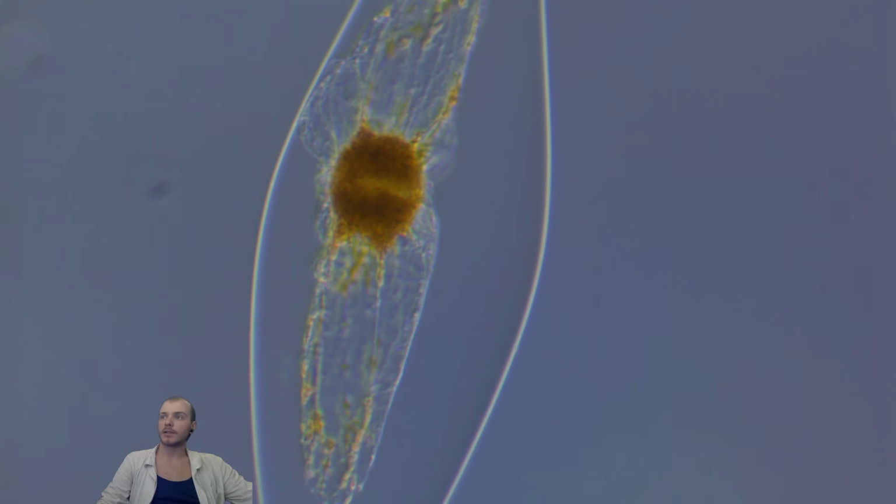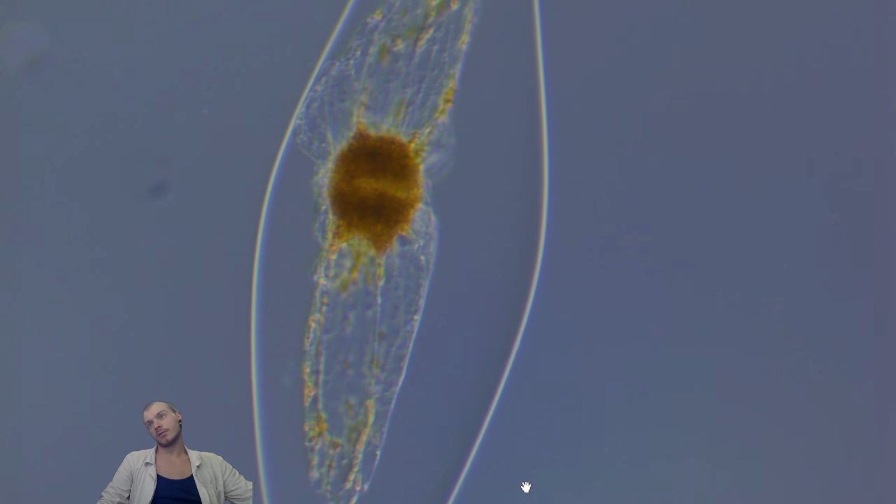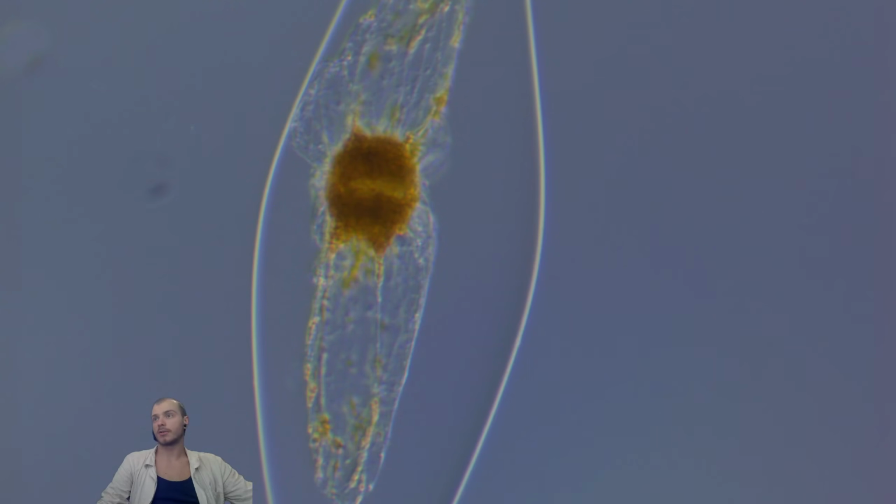So this is not a healthy cell. This is probably due to too much or too little water in the cell, because the space here is more salty or more concentrated by ions than the inside of the cell.